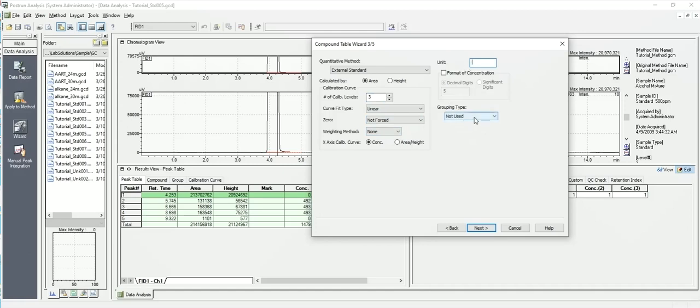There's something called grouping as well. What grouping is, is where you can take a group of peaks and treat them as one peak. So perhaps you're analyzing some kind of aldehydes. You can just get total aldehydes and just calculate aldehydes, something of that nature. But I'm going to say next.